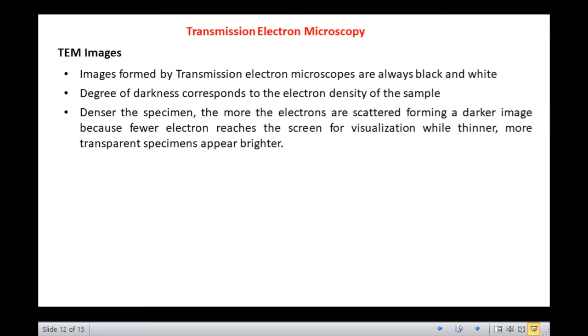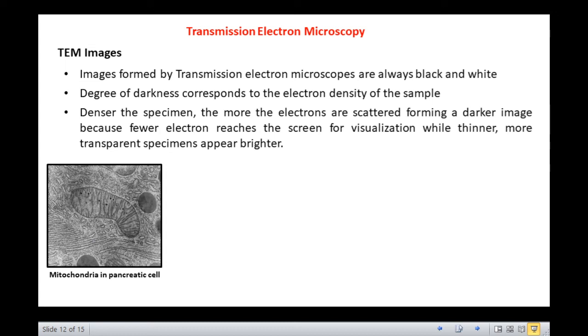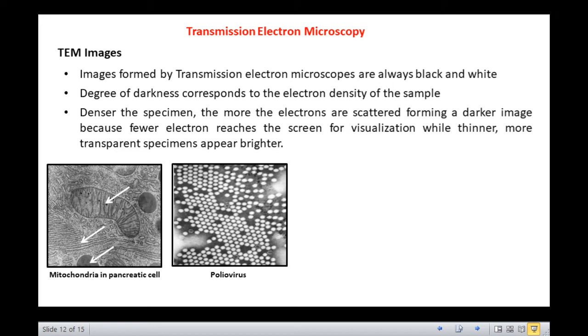Let us see a few representative photographs obtained by transmission electron microscopes. This is a pancreatic cell. Observe the mitochondria, vacuoles, and do not miss the Golgi bodies. This is poliovirus, one of the smallest viruses, about 30 nanometers in diameter.